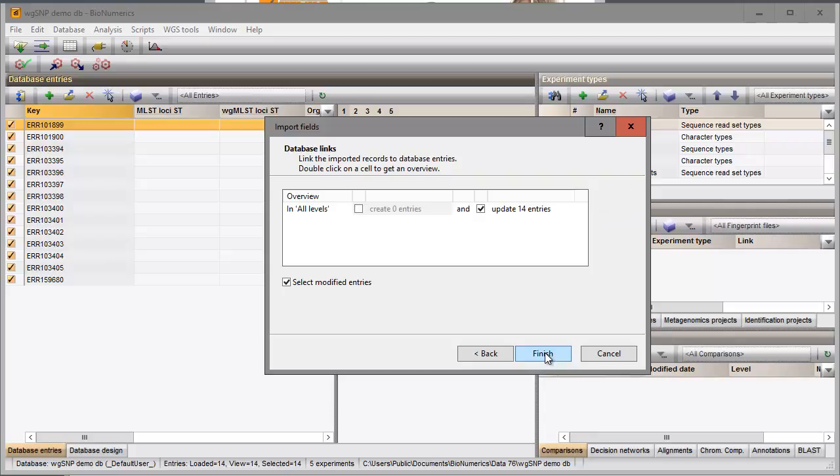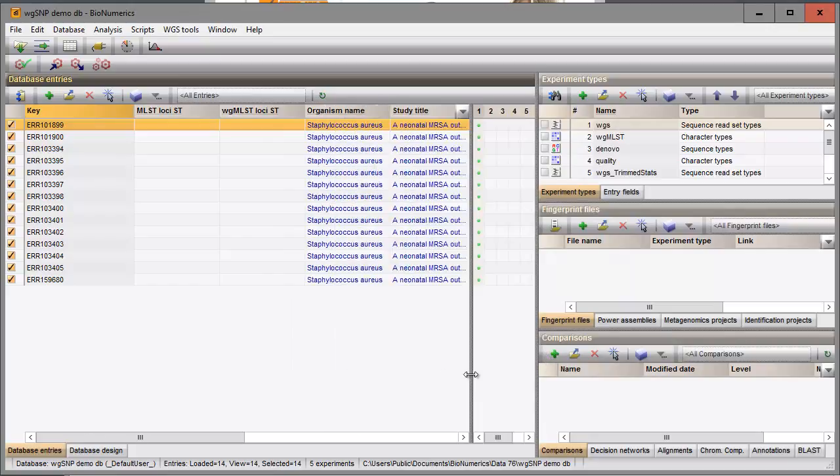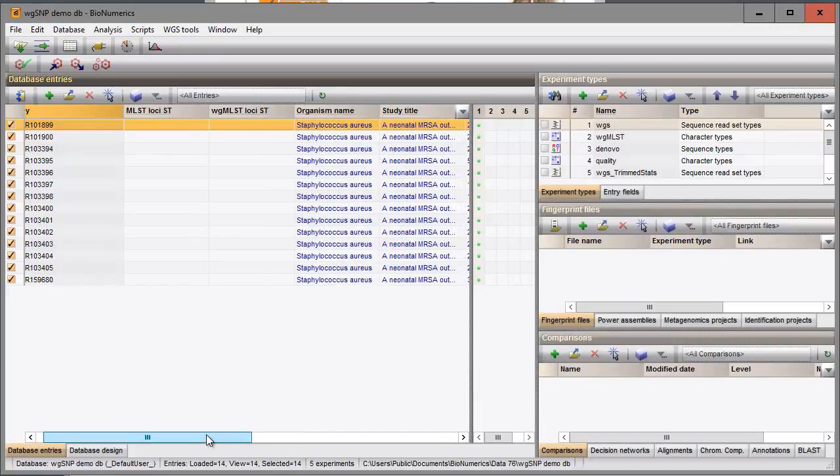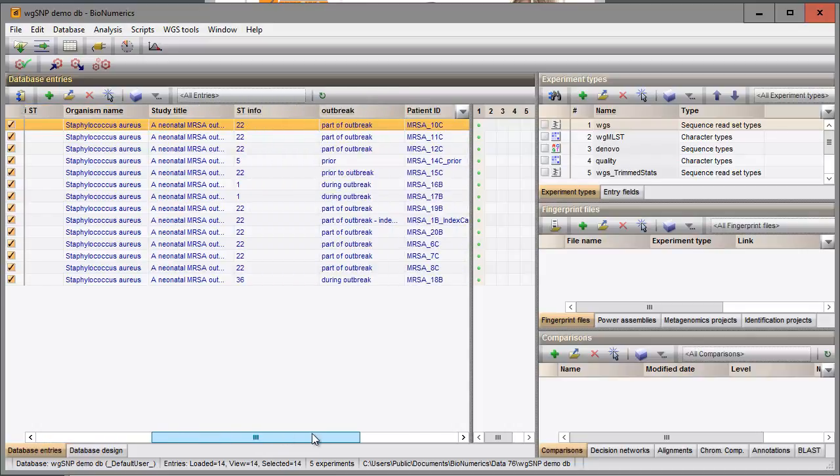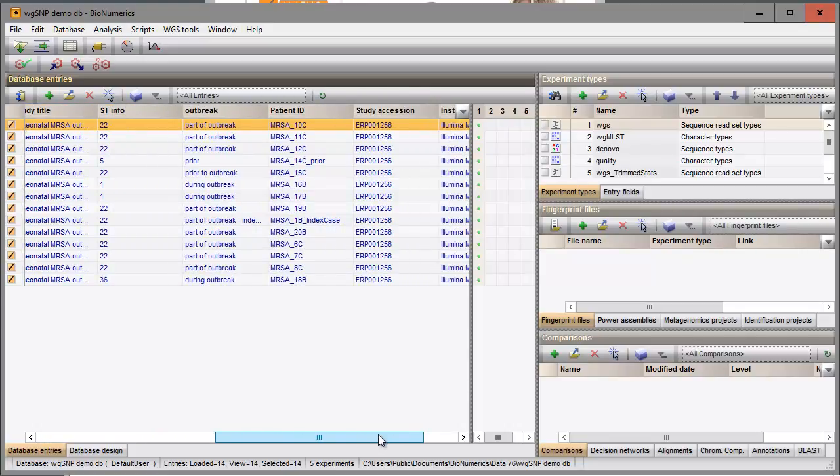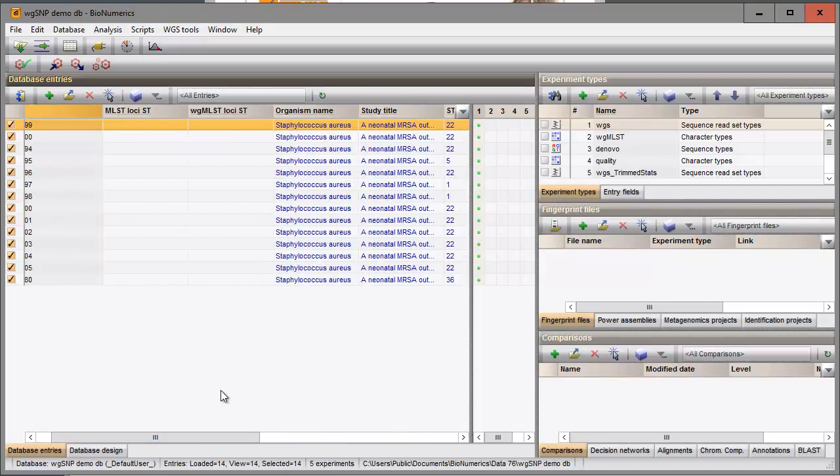And press Finish to import the data in my database. The Database Entries panel is updated. This ends this video. Please tune in to our other videos about Whole Genome SNP to learn more about the workflow in Binumerics.